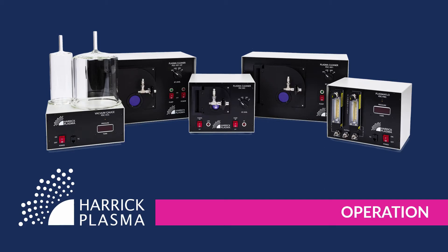PDMS bonding using plasma treatment is an essential step in the development of microfluidic devices. Due to its low cost and high versatility, PDMS is used throughout professional and academic laboratories.